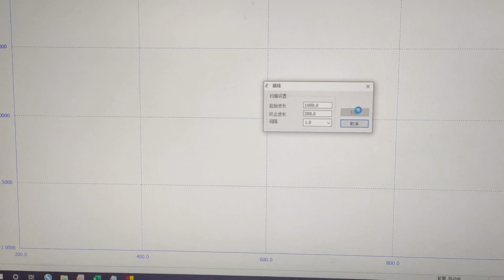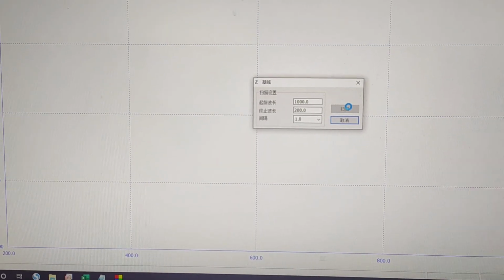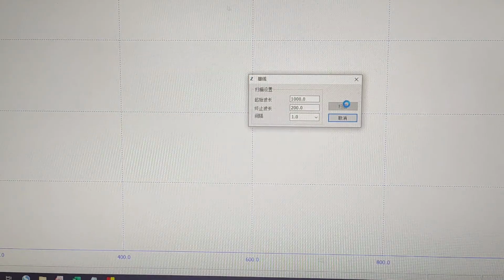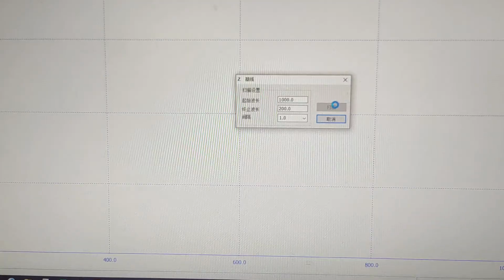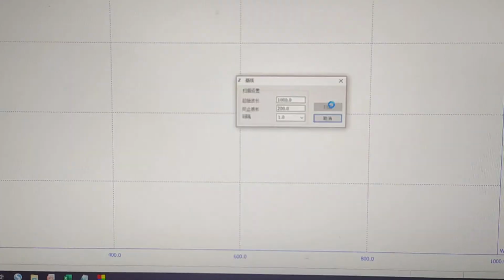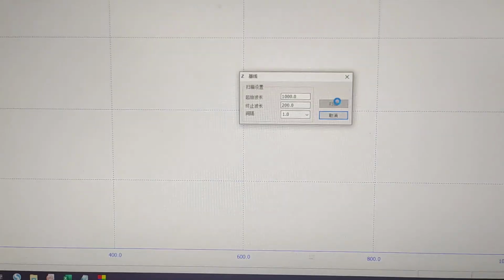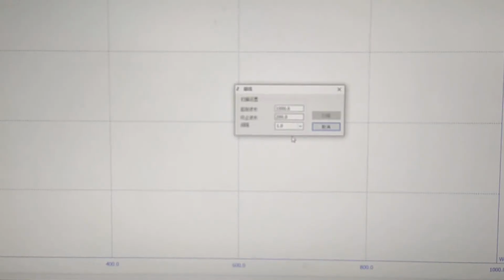If you use water, then add water. If you use oil, then you will add oil, or any other solution. You must add it first and make the calibration for this liquid. Some instruments, like this one, allow you to add the reference liquid beside your samples. And some instruments only have the ability to hold one sample, but we will use one cuvette for all of our samples, and also for measuring the reference sample.